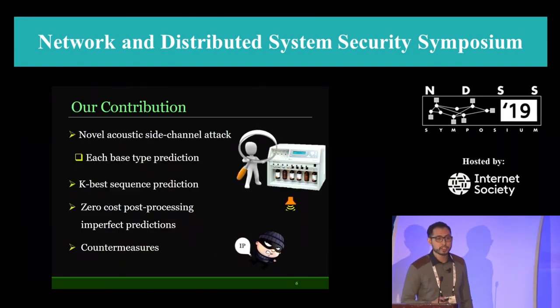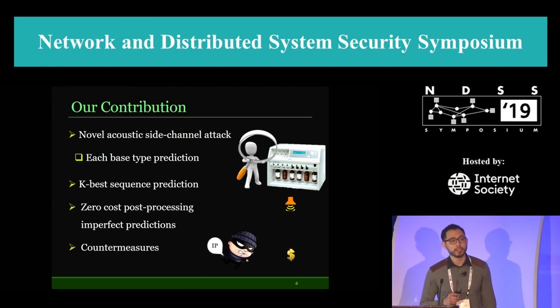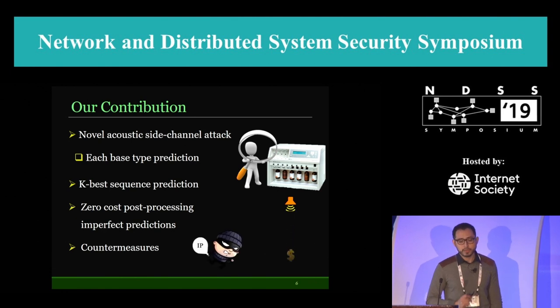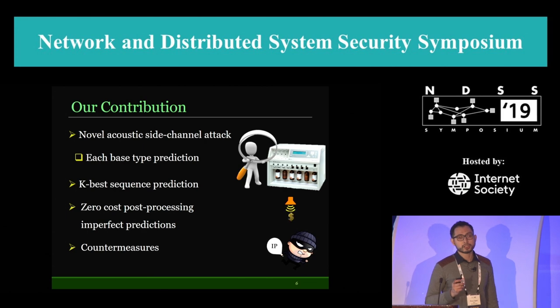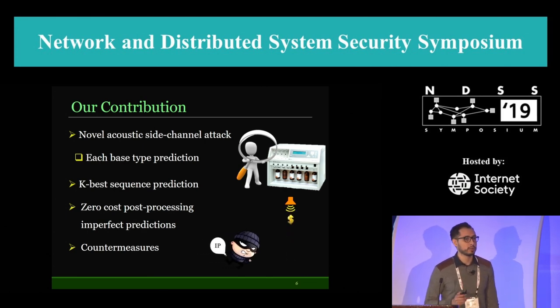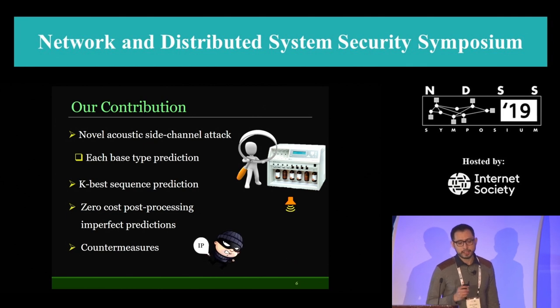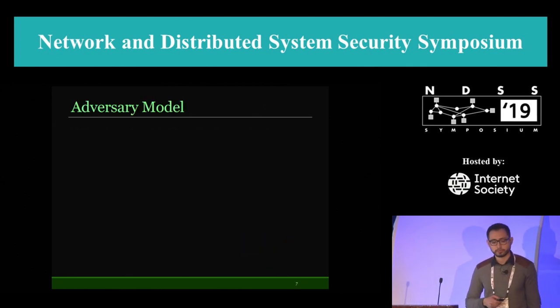With this motivation, I'm going to introduce you to a new way of stealing the order of the bases in the DNA molecules through acoustic side channels. Along the way, I'm going to talk about a new interesting algorithm and show how freely available tools can help the attacker with his mission. And at the end, I will shortly talk about possible countermeasures.